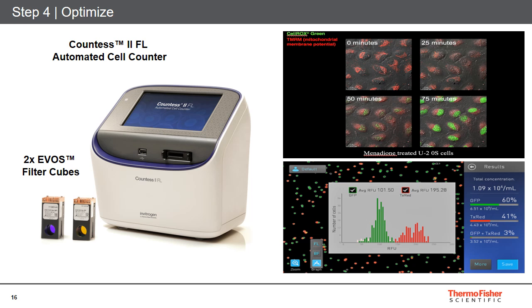So if we go back to that same example from the previous slide of investigating mitochondrial health using TMRM and CellROX Green, if we pull samples from these various time points and simply trypsinize the cells so that we can load them into the Countess, we can now assess whether the treatment is working and if the reagents are indeed giving us enough signal in the proper response by assessing the fluorescence in the Countess 2 FL.